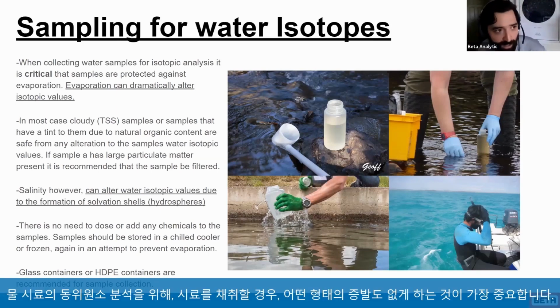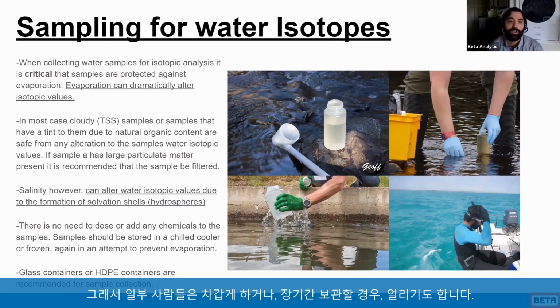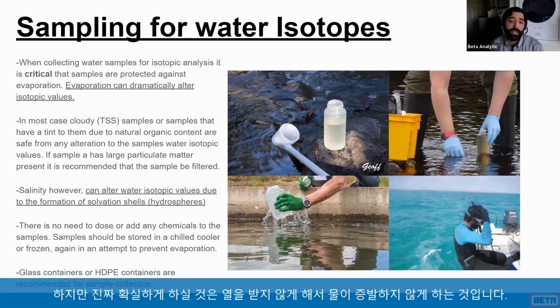But the ultimate and most important point of collecting waters for water isotopic analysis is that you keep these free of any kind of evaporation. So we already talked about how closed basins and aridity can dramatically affect stable isotopes. So when you collect these waters, typically people will chill them. For long-term storage, people will freeze them. But ultimately, what you really want to do is just make sure that you're keeping this water free of any kind of excessive heat that could potentially cause the water to escape the vial, or in this case, the container.